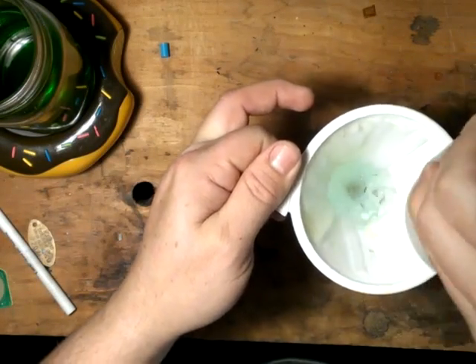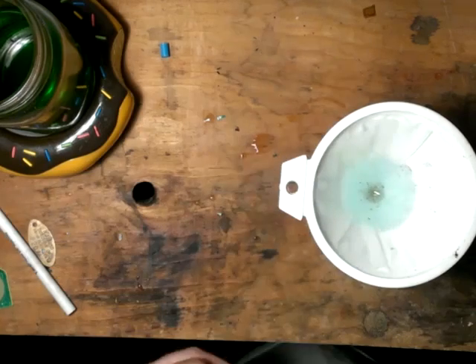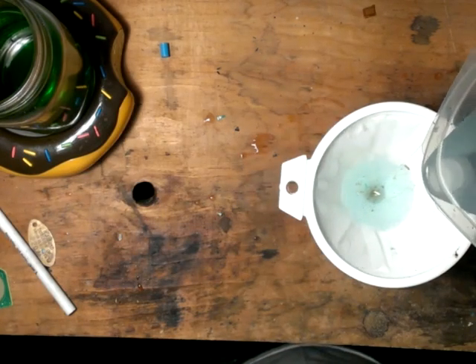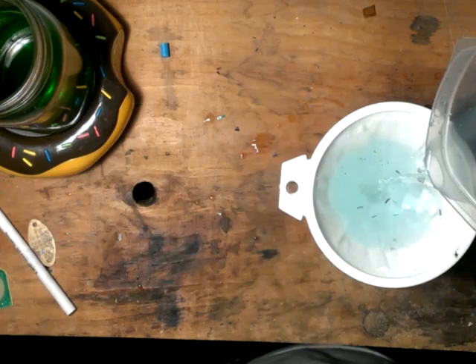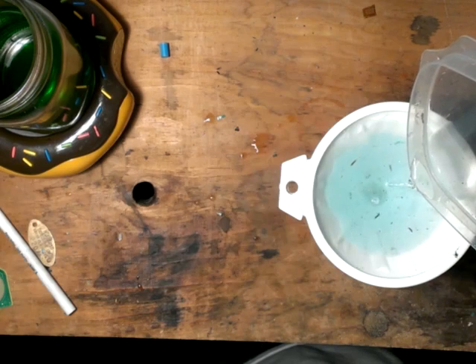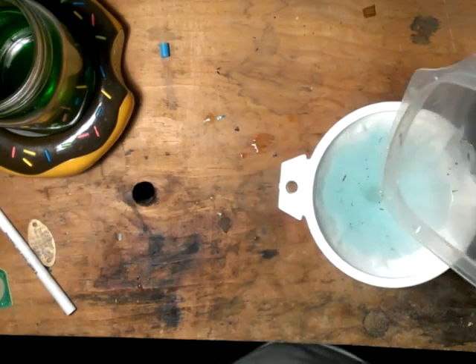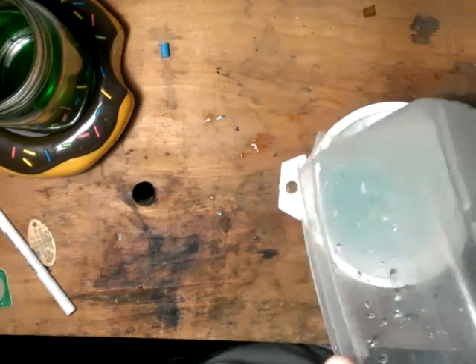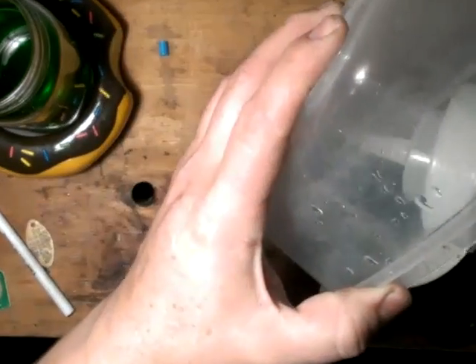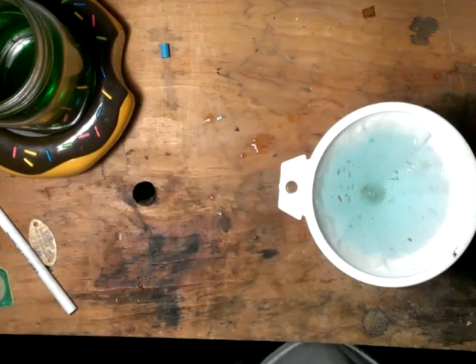Start rinsing this with water, rinse the sides down. Run this through as well — all that gold down in there. Inside our container, let that run through. We will let that settle and we'll be back shortly.